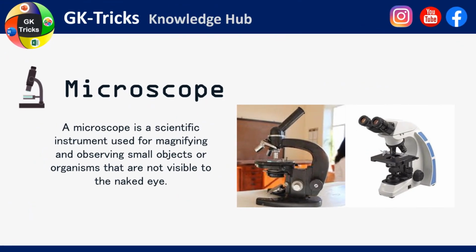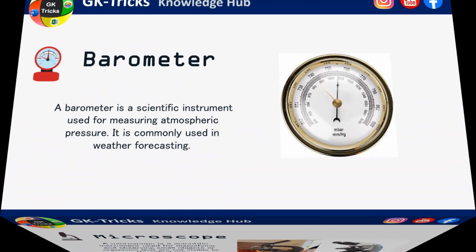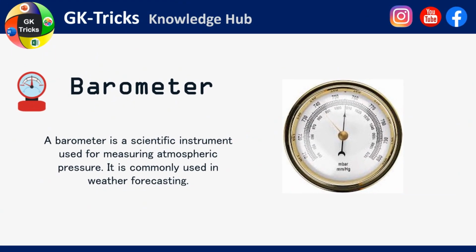Microscope. A microscope is a scientific instrument used for magnifying and observing small objects or organisms that are not visible to the naked eye. Barometer. A barometer is a scientific instrument used for measuring atmospheric pressure. It is commonly used in weather forecasting.